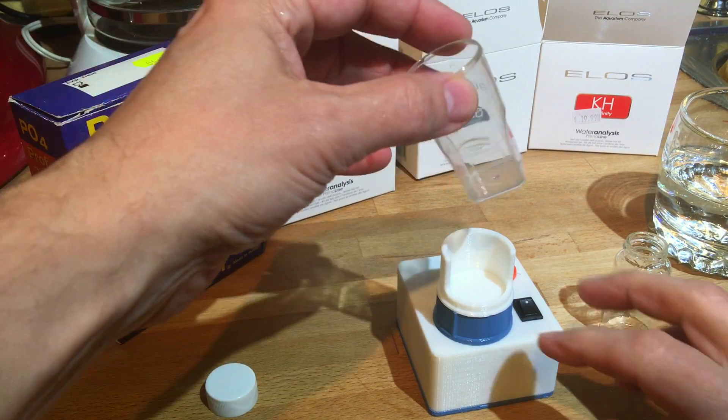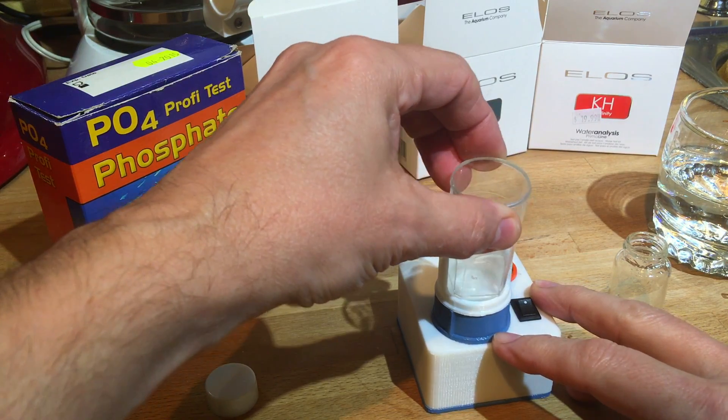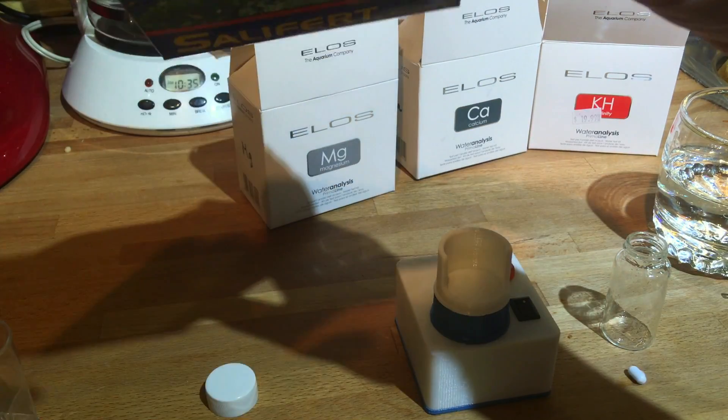The Salifert beaker — I was told it fits, but it doesn't. It doesn't quite fit in there. Maybe he had a different size vial where he was, but I will use the glass one and we'll do the phosphate test kit.